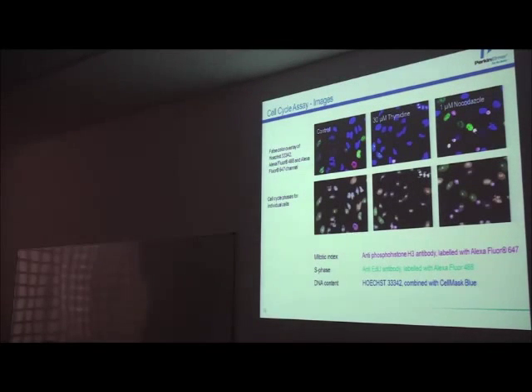So typically here, the software would look at the DNA content, so 2N, 4N, or both chromosomes, using the DNA intensity, total intensity. If we also look at the average intensity, taking the content normalized by the area, the cells after the mitosis will be much smaller, but we have 2N, so you can just put them in another class. And cells which cannot really divide the DNA material will probably increase the DNA content. But the best way actually to do it is really if you have, for instance, a staining for mitosis, for S phase and for the DNA content. That's something you can easily follow. So it makes your analysis much easier.